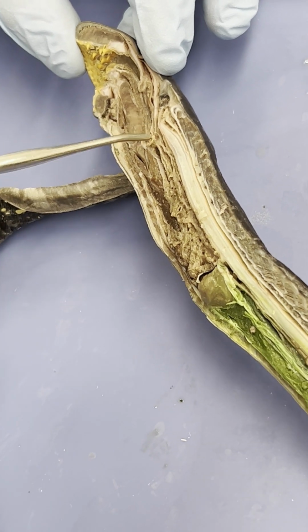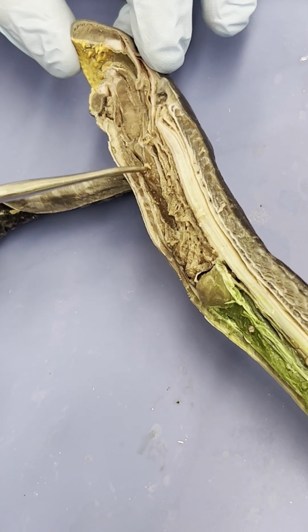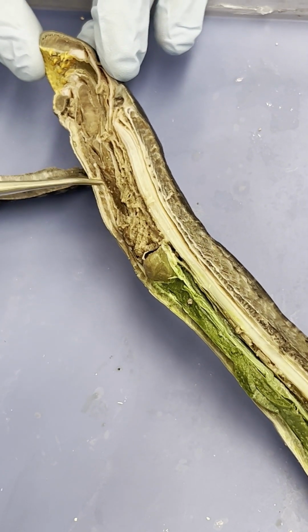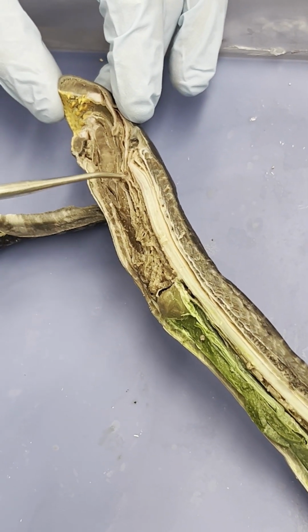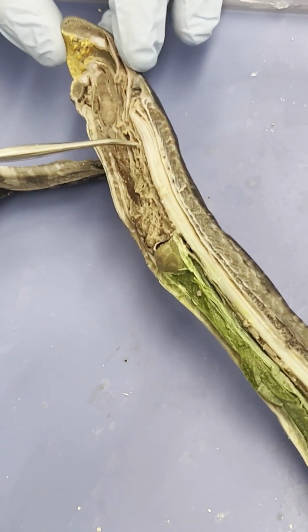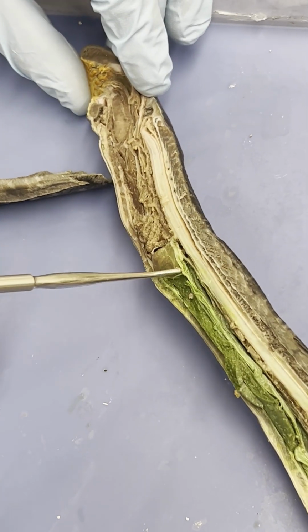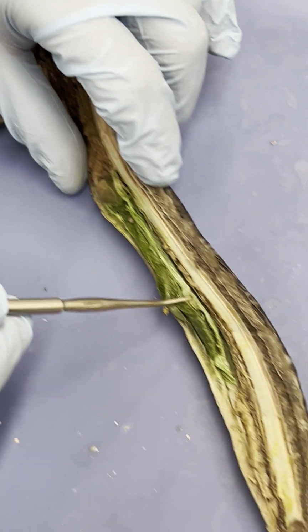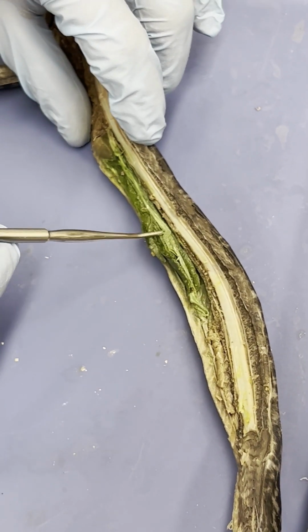Eventually, the pharynx is going to turn into the esophagus, all somewhere around here. And it's a small lamprey that we're actually dealing with, this species, so it's kind of hard to see from the pharynx to the esophagus. But if we follow the esophagus all the way down, we will eventually get into the intestine. So here, I'll see the intestine mostly here.